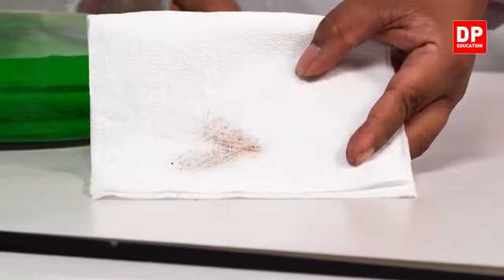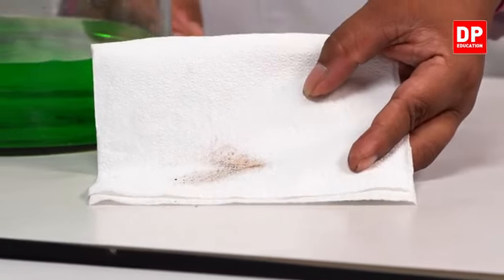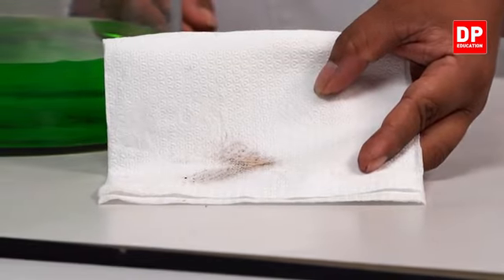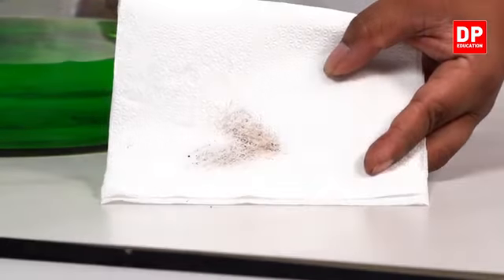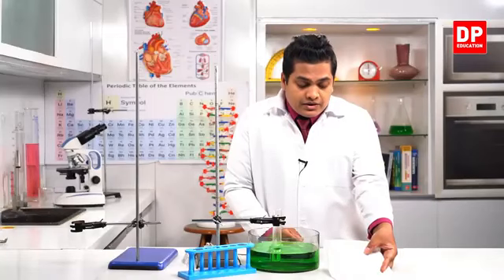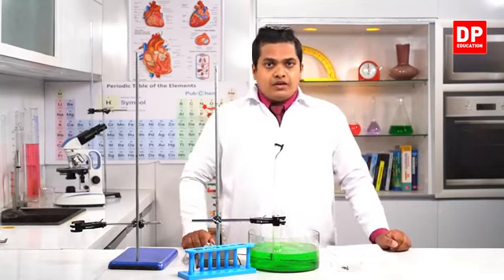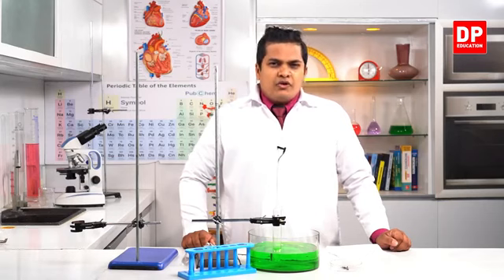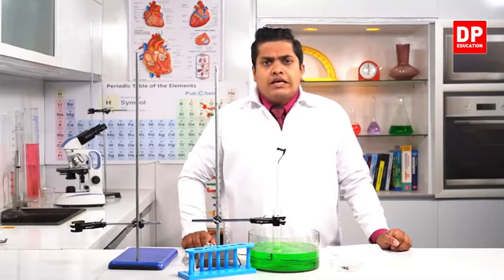See, there is a brownish yellow color stain. That means this iron powder has rust. That's why it contains a brown or brownish yellow stain. So, what is our conclusion from this activity then? You know that about 20% of our atmospheric air is oxygen.